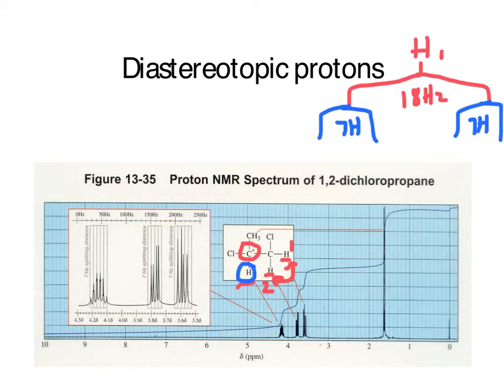And so again, for one hydrogen on this carbon, you're talking about a doublet of doublets. So this is why it gets really complex. H1 will be a doublet of doublets. H2 will be a doublet of doublets. And this H over here is going to couple to the two different protons. It might end up looking simple, and we do see that there, because the coupling constants between those two will be similar. But you get very complicated signals just for 3 protons on a simple molecule.